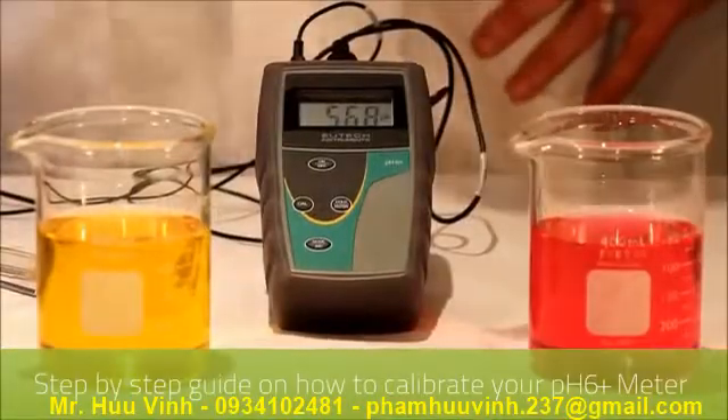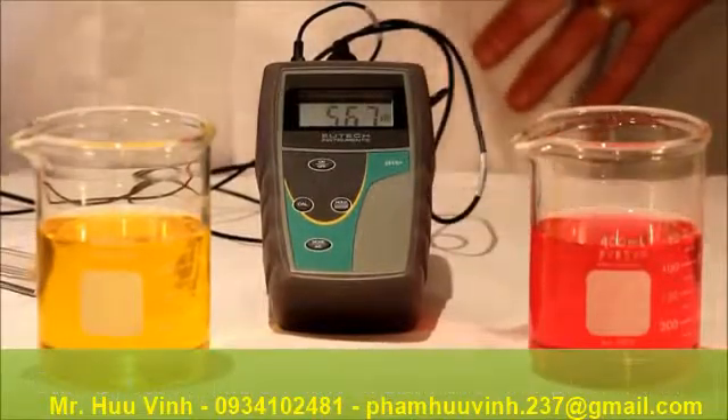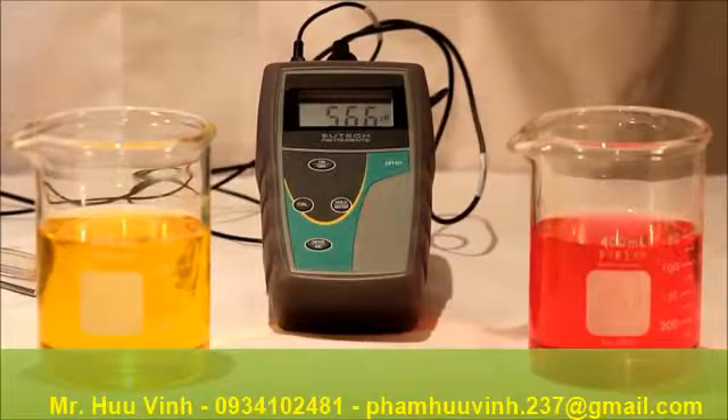Welcome to RMS. This is an informational video on how to calibrate the Utec PH6 Plus portable instrument. For this you will need your buffer solutions and deionized water for cleaning between the buffers.